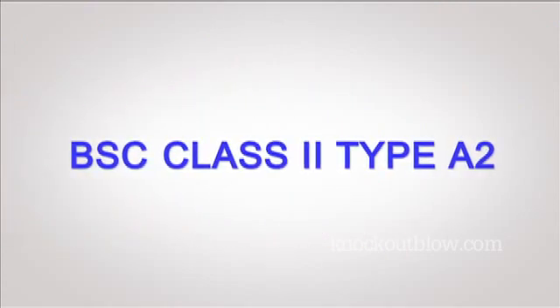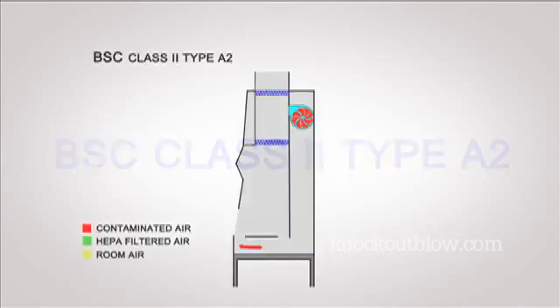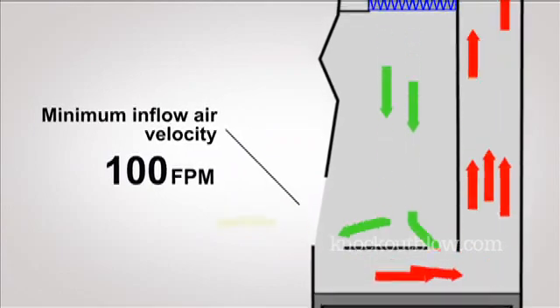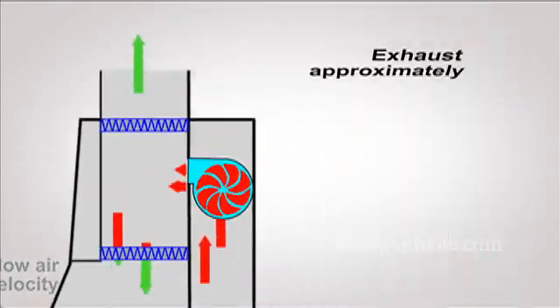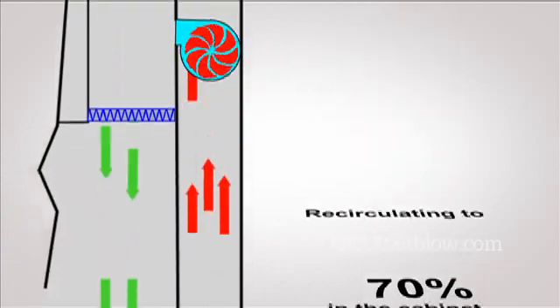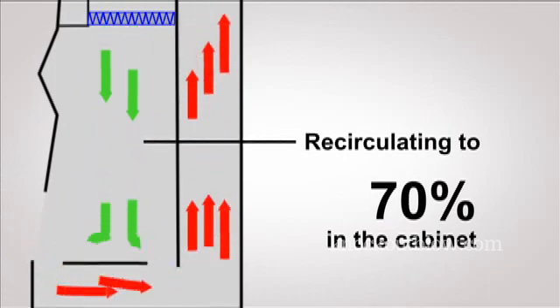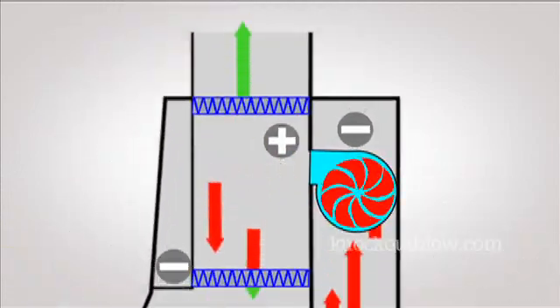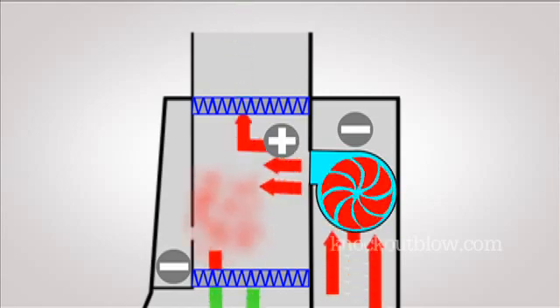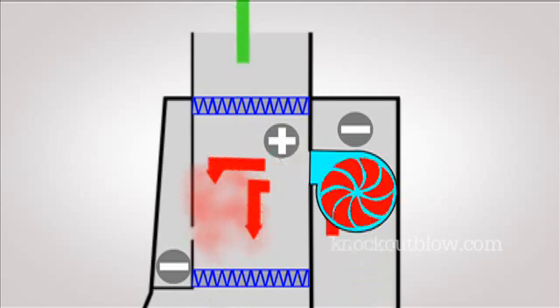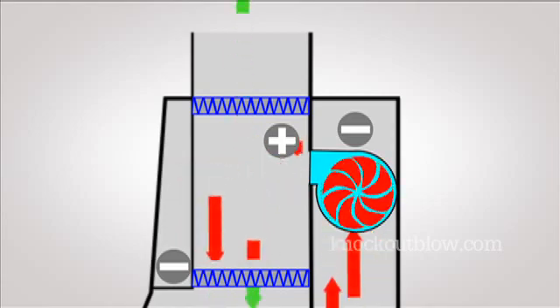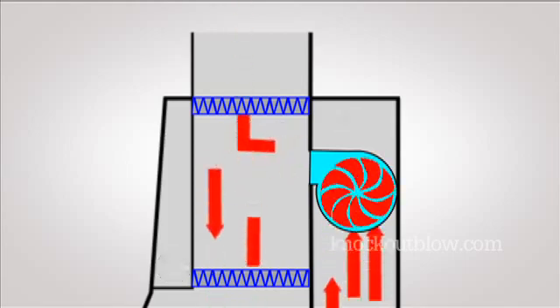BSC class 2 type A2 have a minimum inflow air velocity of 100 feet per minute through the front opening with an exhaust approximately 30% of the total air handled and recirculated to 70% in the cabinet. There is negative pressure or surrounding negative pressure in the ducts and plenums to contain the biologically contaminated air in order to protect the environment if there are any leaks at the exterior surface of the BSC from IATs or BSAT.